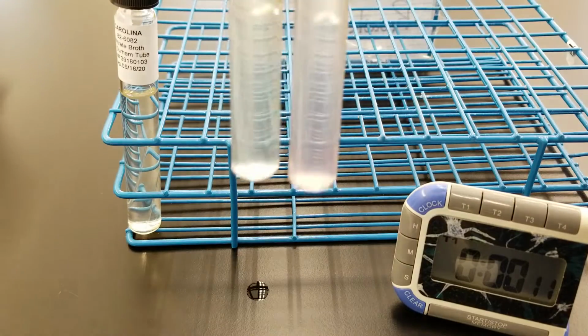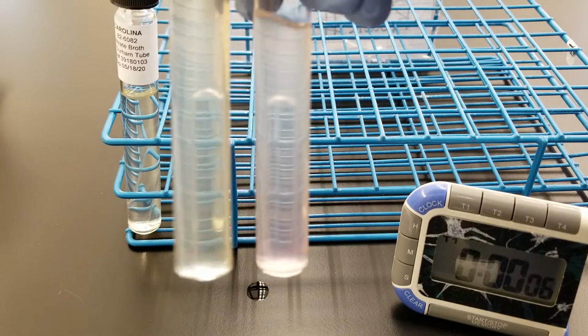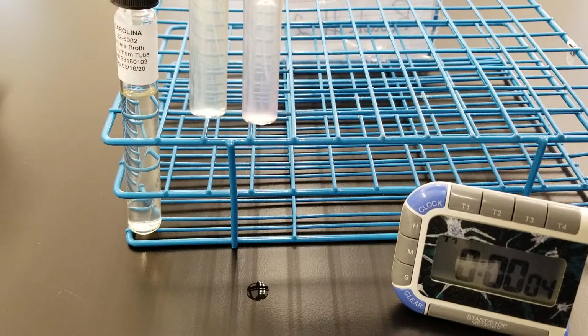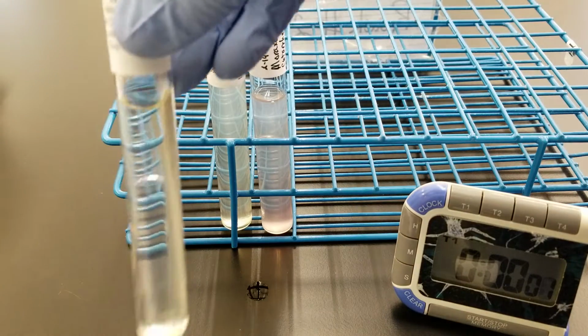Pink to red is positive, and no color change would mean that it's negative. So we do have pink in the Moraxella catarrhalis, which was expected because that's supposed to be positive.